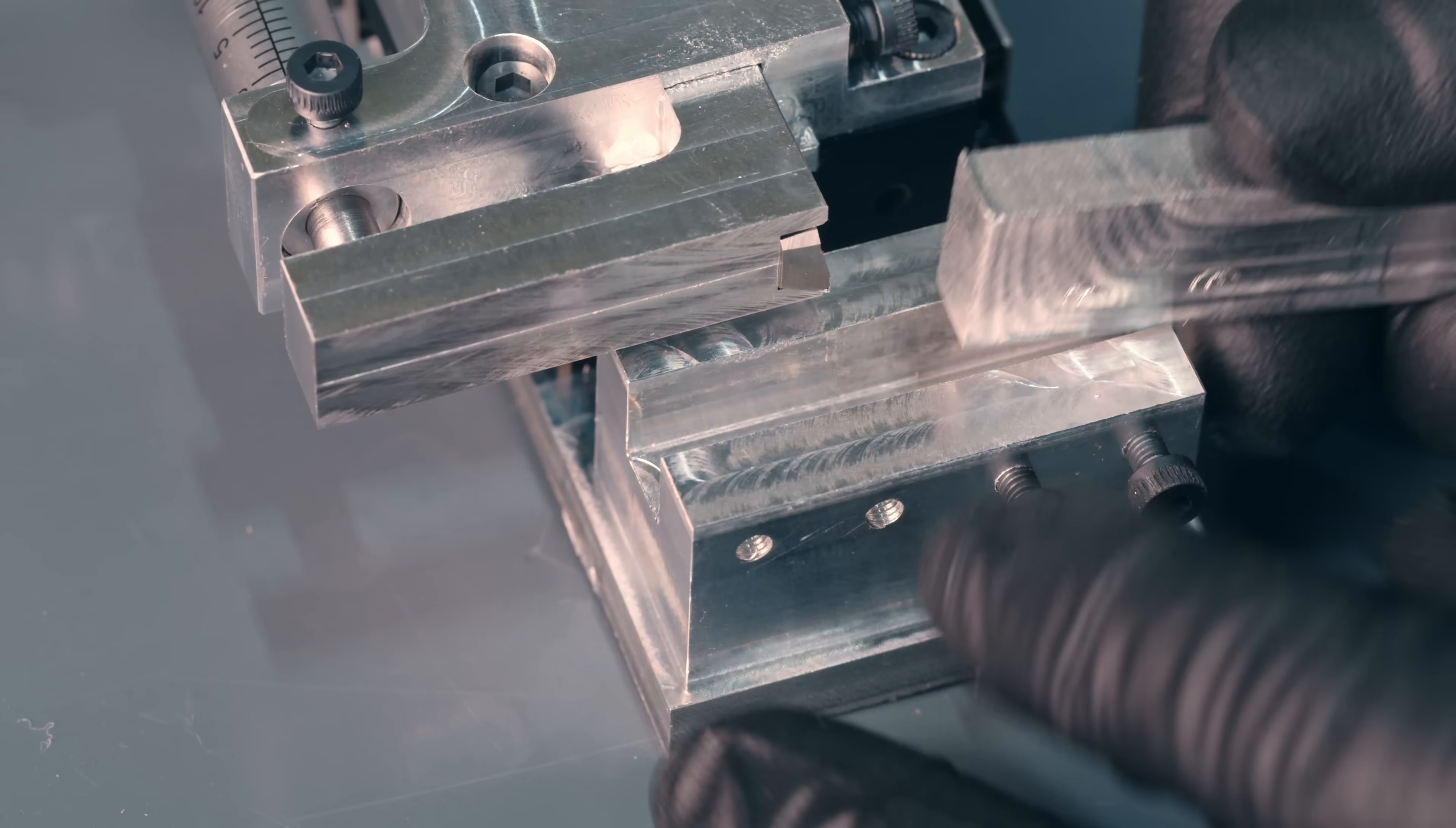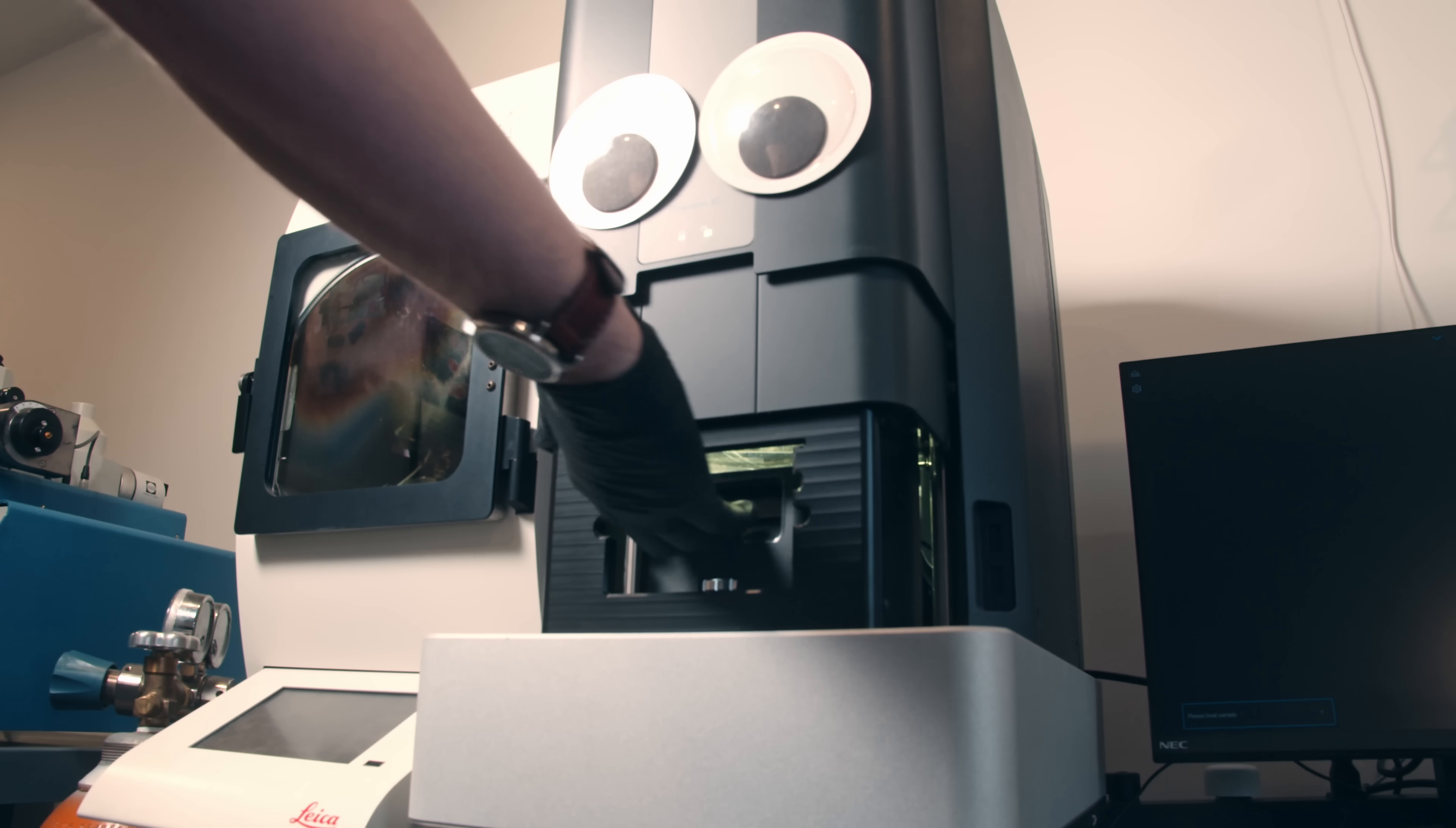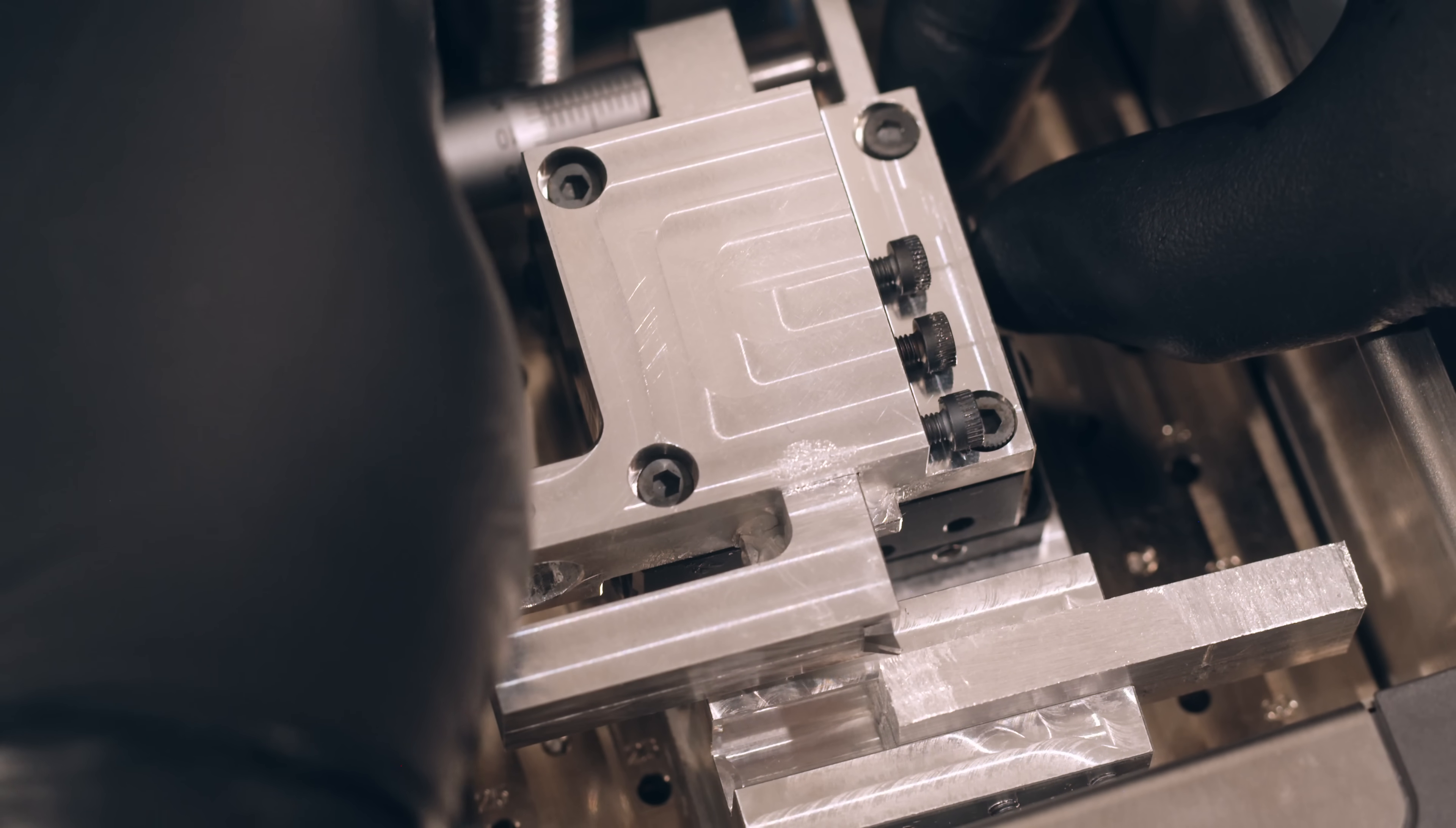So first we mount the material that's to be cut. In this case it's just a small piece of aluminum. Then we position the cutter with the help of a microscope and finally we advance the cutter five ticks on the micrometer. This moves the cutter forward about 50 microns. Because we're advancing this by hand with a little micrometer screw we need to take a relatively shallow cut. In this case I was aiming for between 100 and 200 microns or about 0.2 millimeters. Then we pop it into the scanning electron microscope, pump down the vacuum chamber, position the image, focus, and finally take a photo. Then we pull it out and repeat the process moving forward another 50 microns.